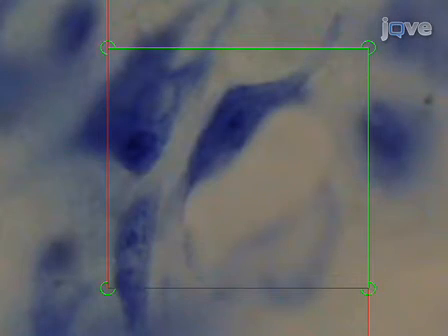To avoid bias from recognition errors, it is imperative that a standard definition is followed for the particular biological feature of interest. Here, we were interested in counting neurons and defined a neuron as having a visible, centrally located nucleolus and a clearly defined cytoplasm.